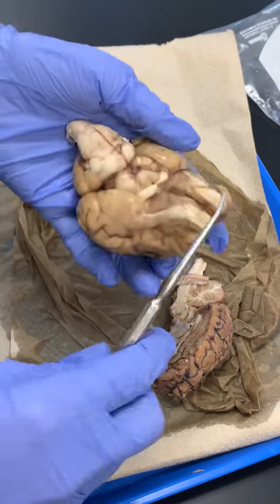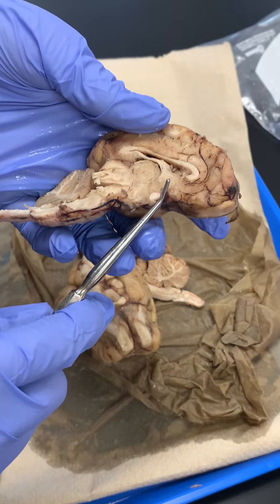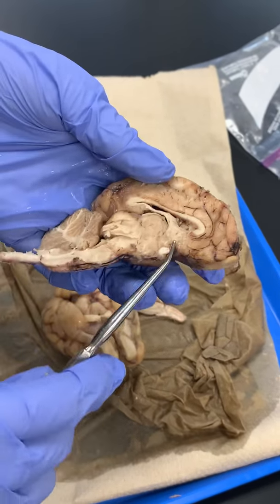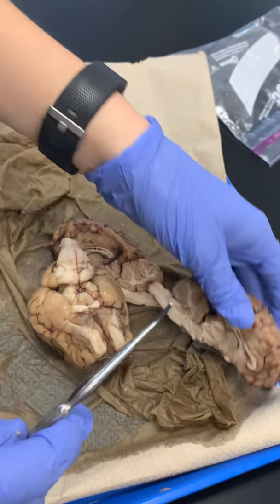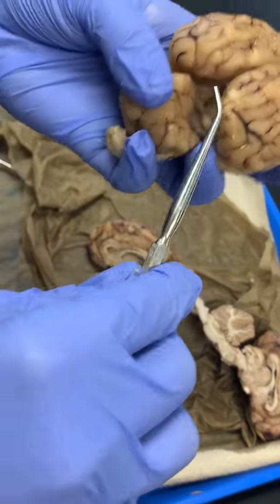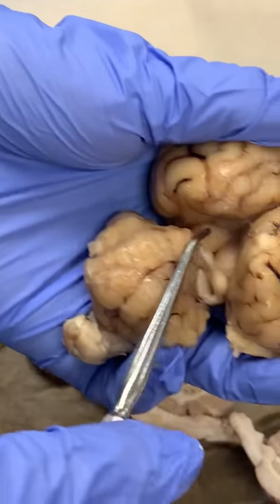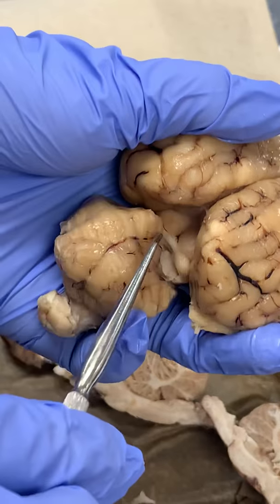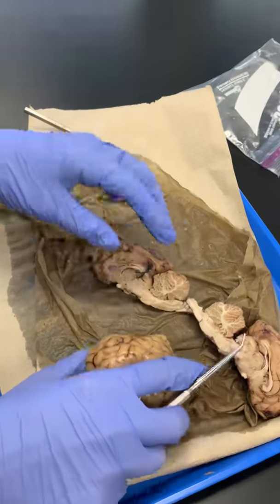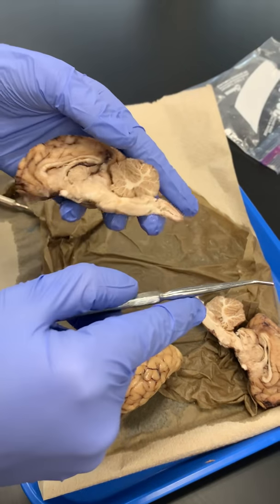The pituitary gland would come off around here, but it was taken off with the dura mater. It's part of the endocrine system, and it secretes hormones into the bloodstream. The corpora quadrigemina is back here. It's kind of butt-shaped, and it is made of 4 colliculi. It's the 2 inferior and the 2 superior, and it's in charge of reflexive actions. And lastly, the central canal would go down through the length of the spinal cord, and it holds the cerebrospinal fluid.